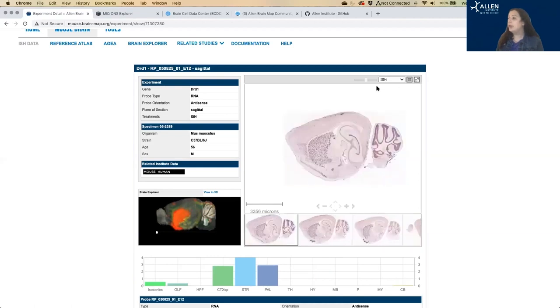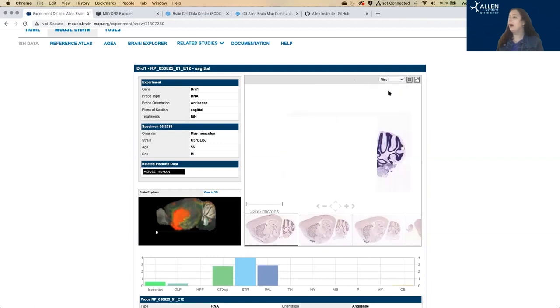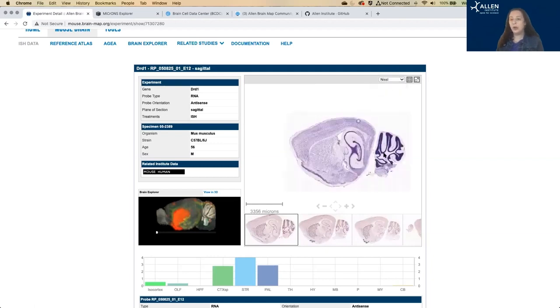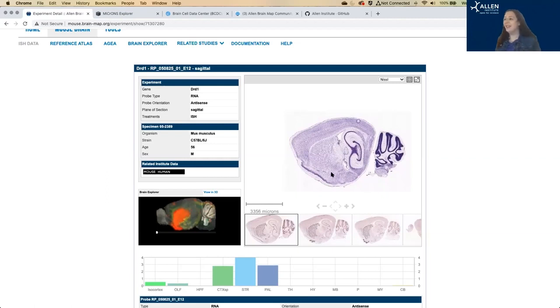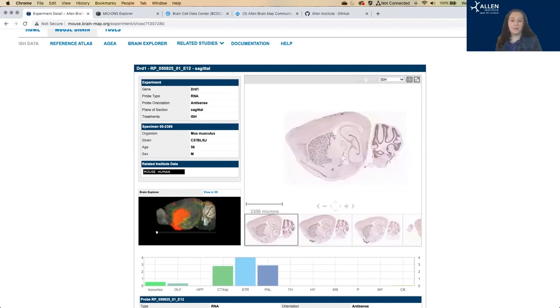And if you use this drop-down menu here, up in the upper right, you can switch over to a Nissel stain that just shows you where the cell bodies are to give you a sense of the relative location of the cell bodies that you need for the ISH.